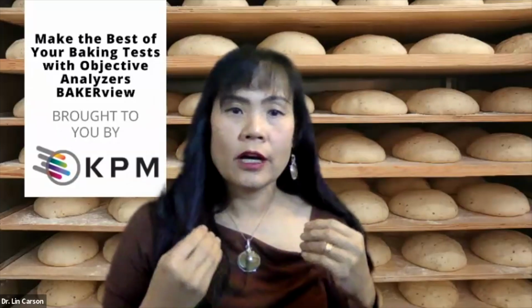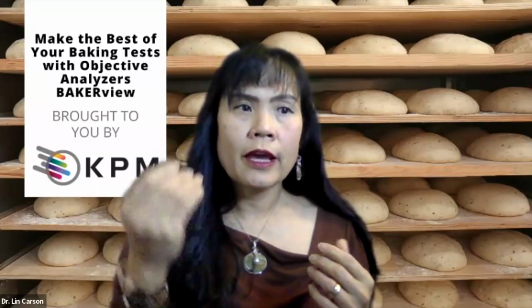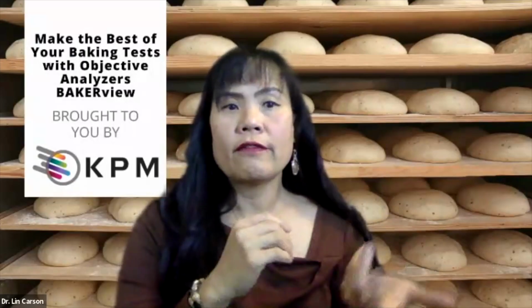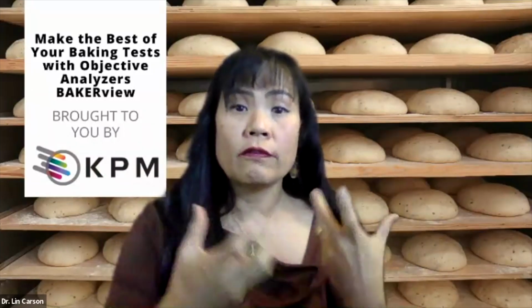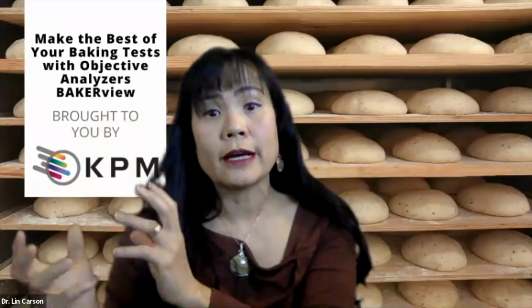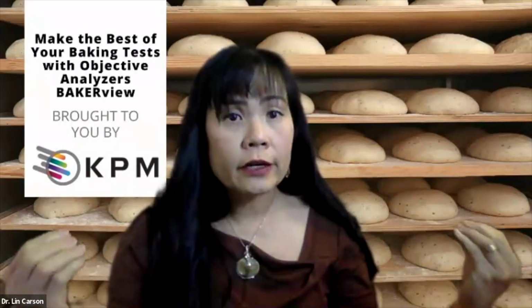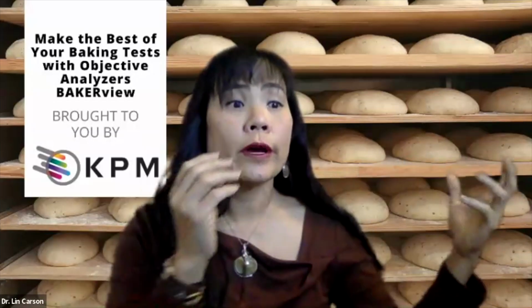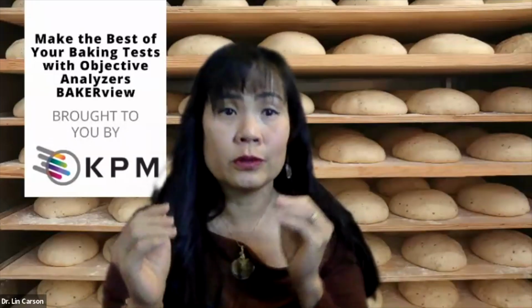So the key is to understand your fermentation process. Alina, correct me if I'm wrong. Can they actually take the final product and put it into the RheoF4 and study it? Yeah, absolutely. So if you're able to do that for at least 100 samples, just to understand the capabilities of your process, the outliers of your process, then you'll be able to correlate that data to the sightline data. That's important, because you want to really streamline your process and make sure that you don't waste money in putting in too much yeast. At the same time, your oven was never meant to be a proofer, so don't treat it that way. Okay?